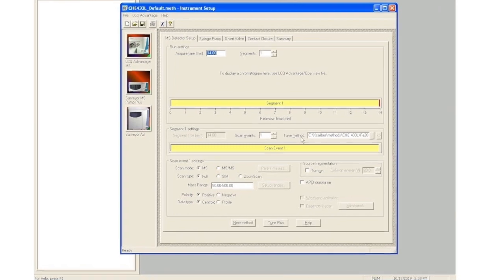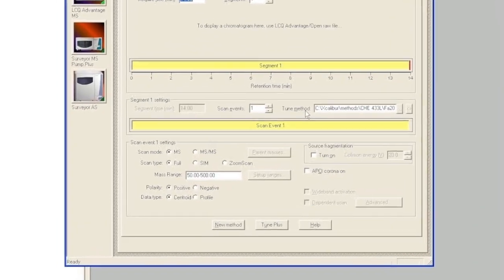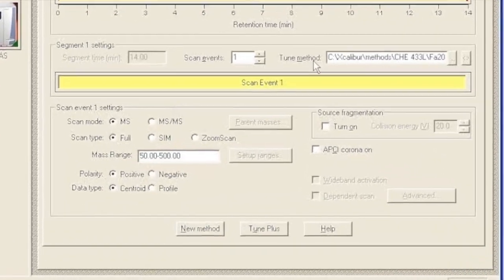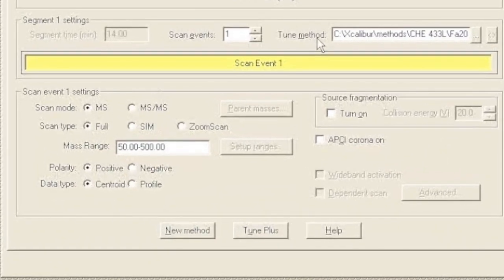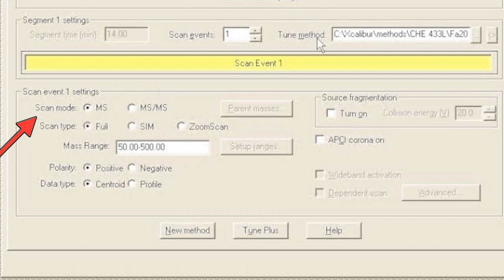Let's look more closely now at some of the more important parameters in the MS method. The first is the scan mode, which we want to have set to MS, and that's really just a normal mass spectrum. In a little bit we'll talk about MSMS, which is a fragmentation spectrum, but you want to start with your MS spectrum.